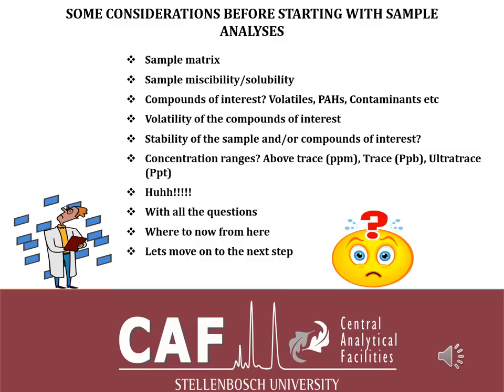And also, what are the compounds of interest? When it comes to volatiles, what type of volatiles are you talking about? Terpenes? Alcohols? Esters? Because it could help you determine what type of sample prep, whether you do liquid extraction, solid phase extraction, or headspace. Are you talking about pesticides? Then you might have to consider doing QuEChERS. You might consider doing solid phase extraction based on whether you're working with a liquid or a solid.